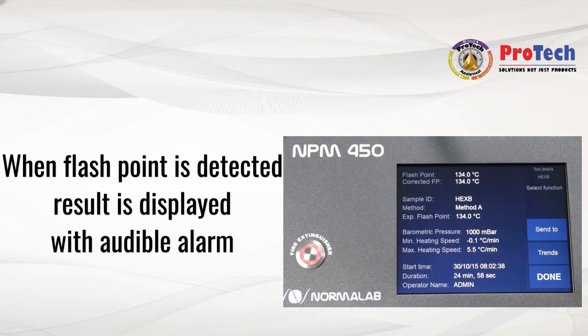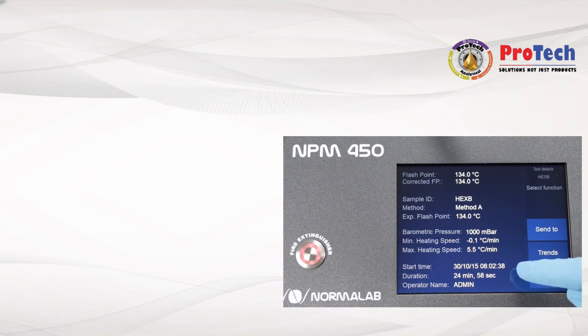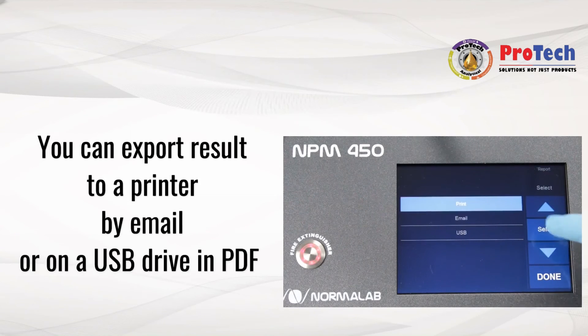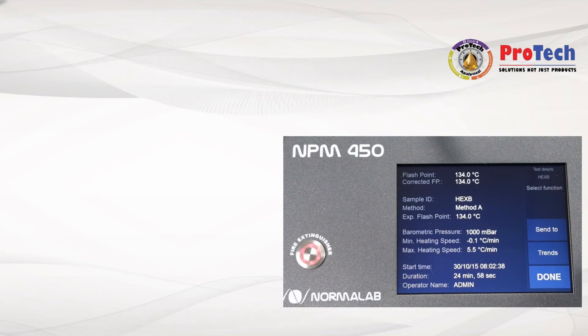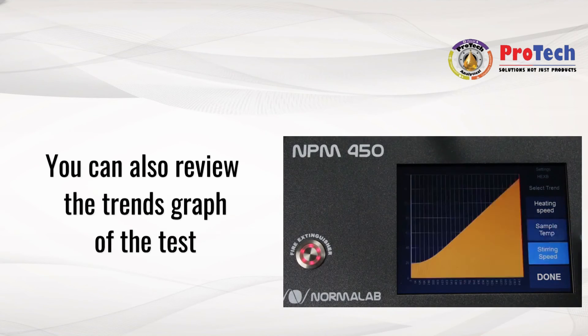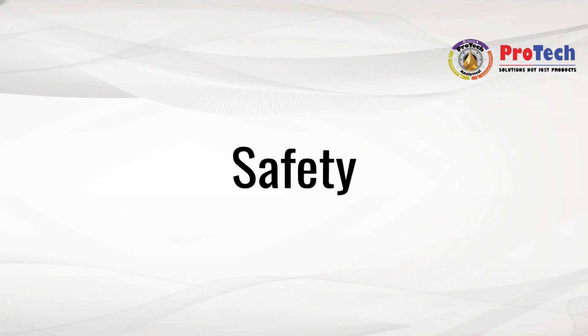When the sample flashpoint is detected, the result is displayed with an audible alarm. You can then export the result to a printer, by email, or on a USB drive in PDF format. You can also review the trends graph of the test.